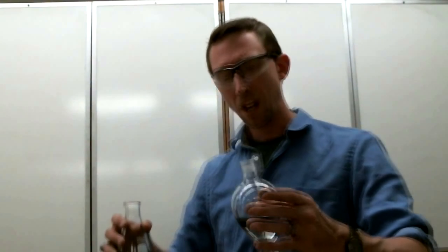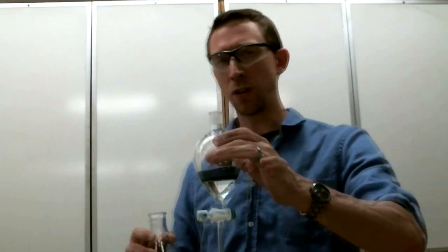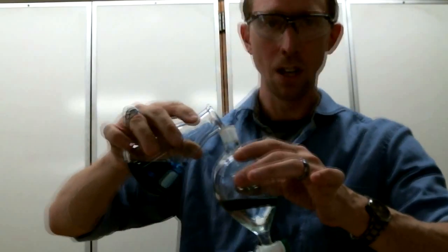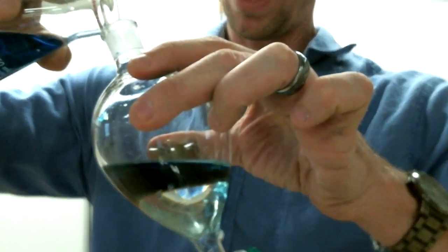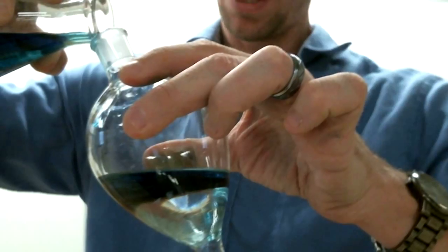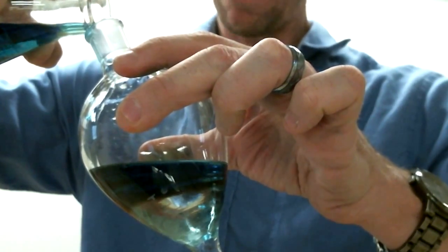Okay, and we're back. So I've got just a little tiny bit of that butanol solution layered on top using a transfer pipette. And now I'm going to add the rest very, very carefully so that it doesn't disturb the water layer. And because N-butanol has a density of about 0.8 or about 80% that of water, if I add it very carefully, I should be able to get that butanol to just layer on top very nicely.